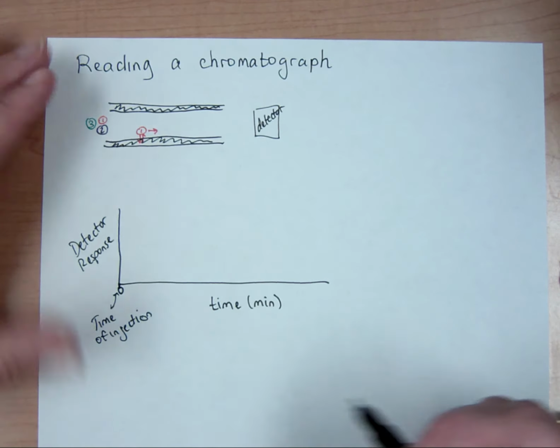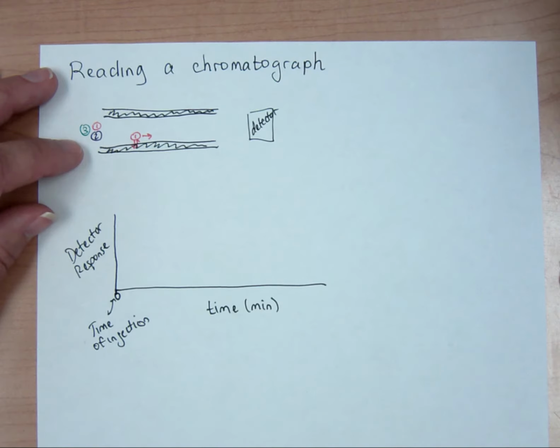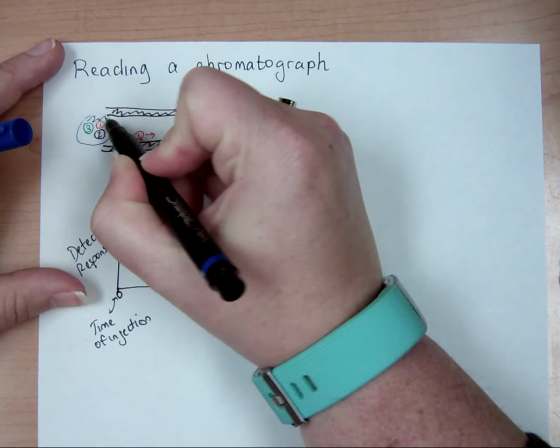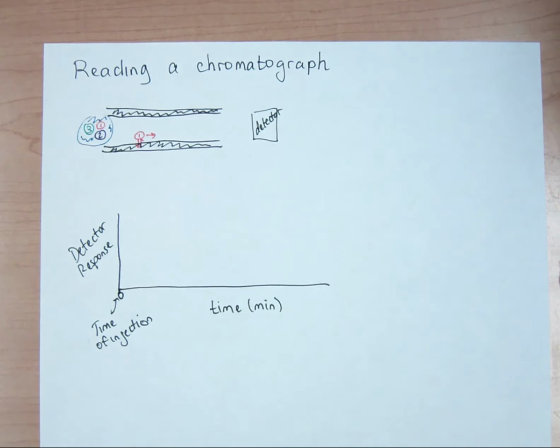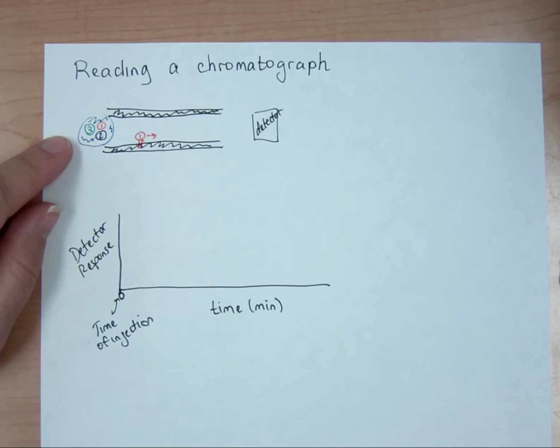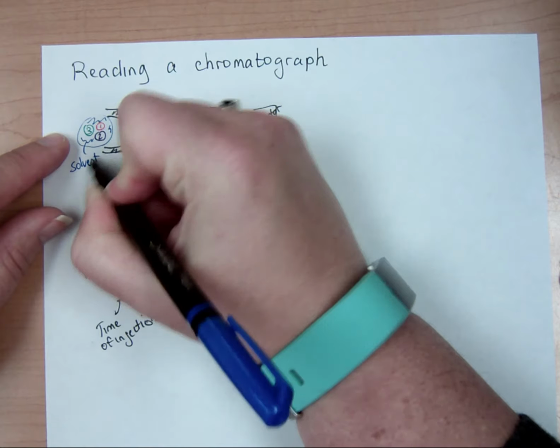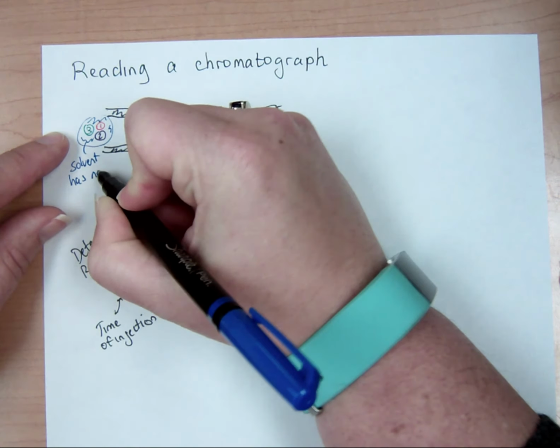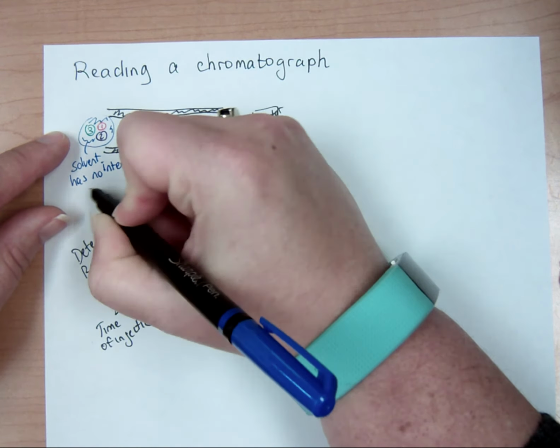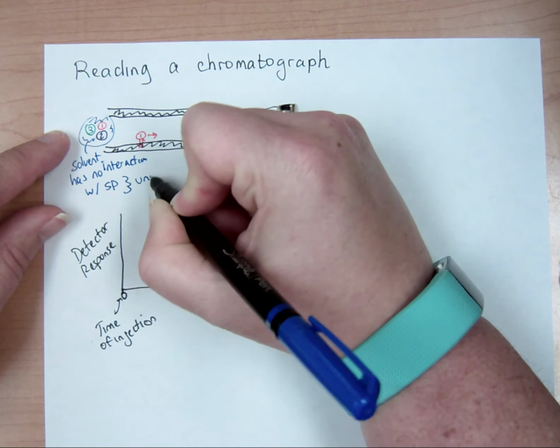Okay. Now these are in some kind of a solvent. So at some point we have the solvent that surrounds these, that is going to still take some time to move through the column, even if the solvent does not react at all, or has no interaction, not reaction, but no interaction with your stationary phase, and so we would call this unretained.